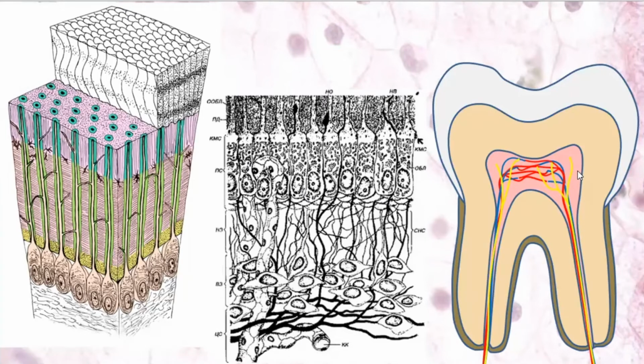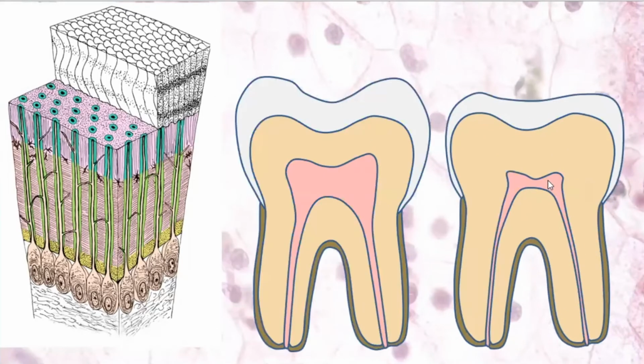in the peripheral zone. And we can see age changes of pulp and dentine which occur during our life. You know that odontoblasts continue producing new dentine, and they are moving to the central regions of the pulp, and the pulp becomes smaller and smaller. Pulp cavity becomes smaller and dentine thickness becomes bigger and bigger, and cell bodies of odontoblasts are moving to the central zones of the pulp cavity.